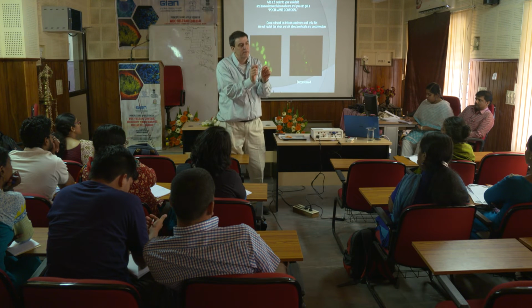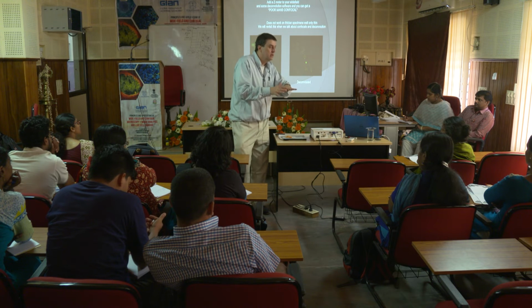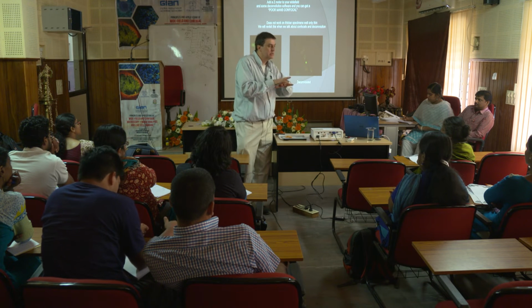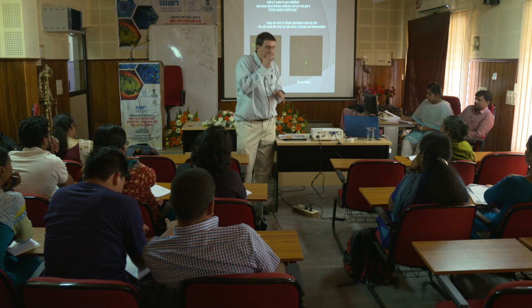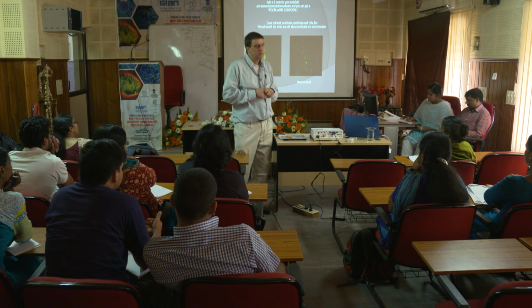So it's all in the prep, and we'll talk a little bit more about that, because once you take it to the scope, it's done. You know what I mean? There's only so many things you can do to try to correct for the background. So a lot of that's with the prep, and we'll talk more about that as the course goes on.